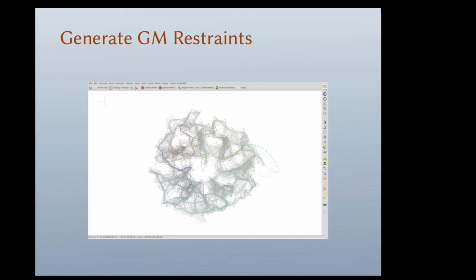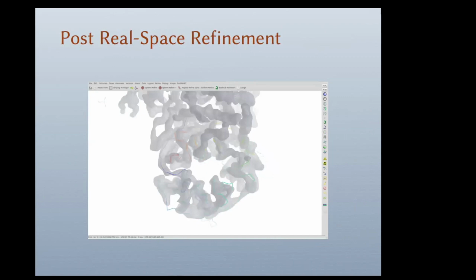In fact, the video from 2019 has, well, okay, it's the previous iteration of this, but largely the current situation is as it is in that 2019 video, if you wish to look at it. Okay, and having done the refinement, it takes a few seconds. Well, I say a few seconds, it's more like 30 than 3. Then we get a better fit.